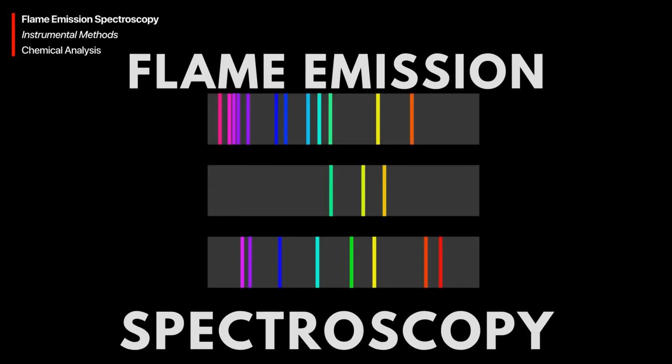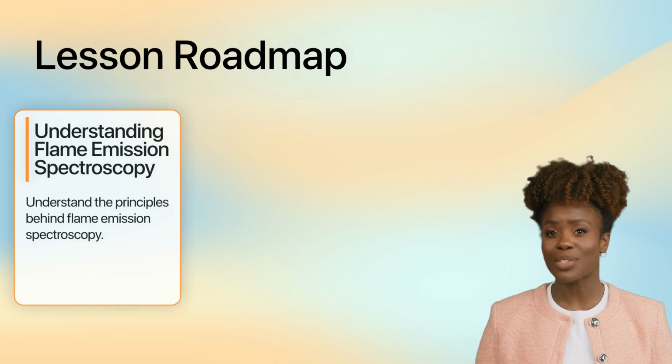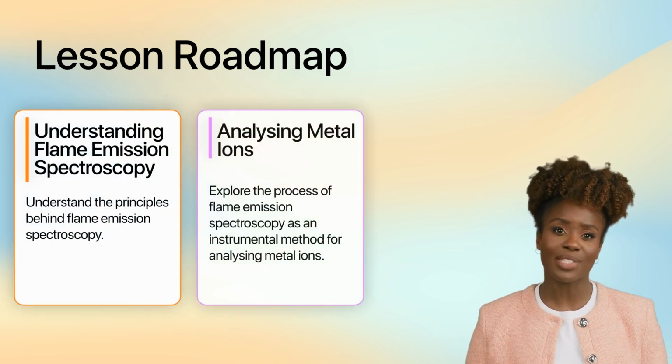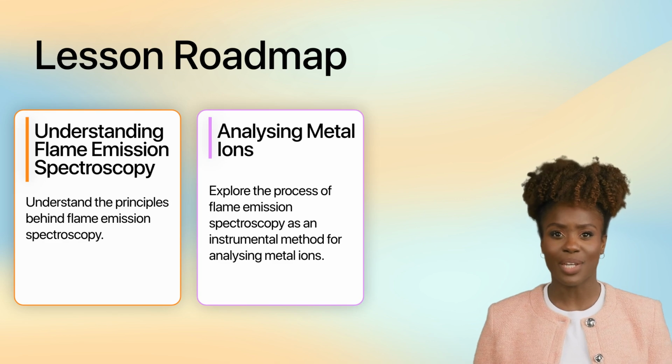Hello and welcome to this lesson on flame emission spectroscopy. In today's lesson, we will understand the principles behind flame emission spectroscopy. We will also explore the process of flame emission spectroscopy as an instrumental method for analyzing metal ions.